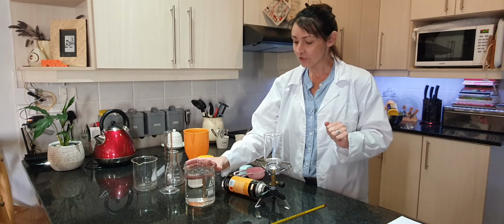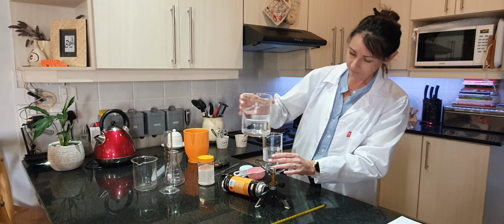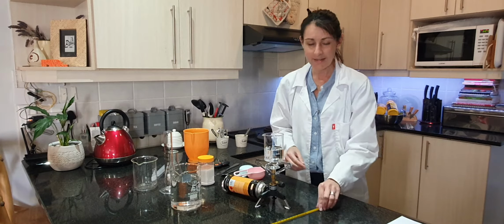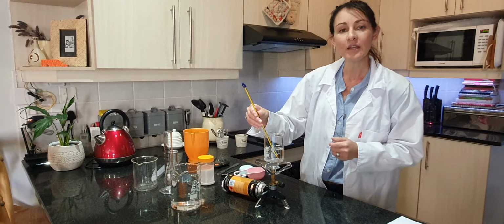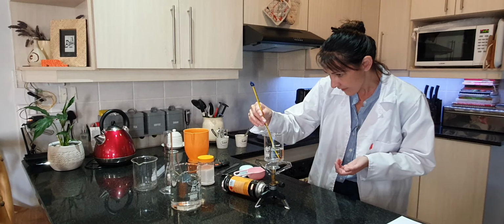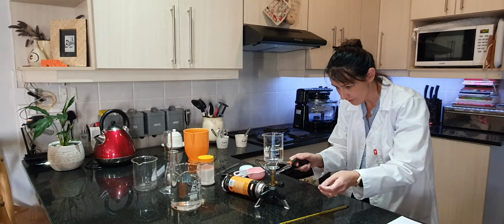Right, so we're going to start off by putting 150 milliliters of water in my glass beaker. There I've measured it, 150 milliliters of water. I'm going to switch my gas on, but before I do that, I want to take the temperature and see what the temperature of the water is before it starts to boil. This one seems like it is 20 degrees Celsius. So I'm going to switch it on. There we go.